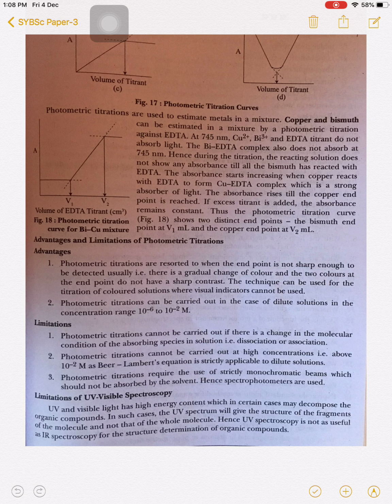So this is the whole chapter we have studied, instrumental methods. From the beginning we started this chapter with the relation between the analyte stimulus and measurement of change in the observable property. We have seen the block diagram of an analytical instrument.